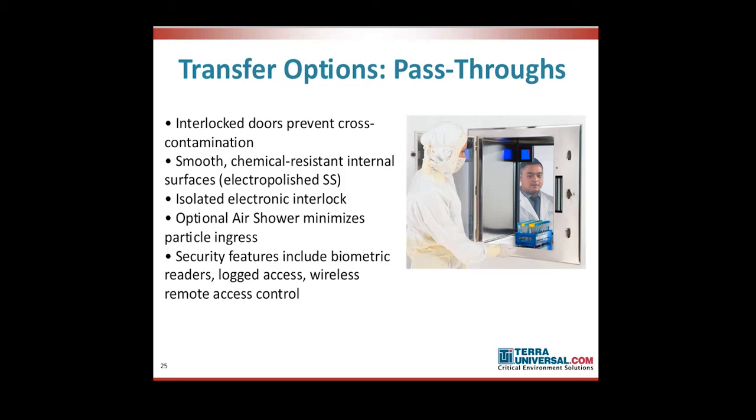So typically, when you're moving a cart into a buffer area, it should stay there for the duration of a compounding shift. So it's not a good way to move product in and out of the buffer area in a high workflow environment. That's partly because the cart would need to be decontaminated every time it moves in and out, and that's an involved process with many steps, and generally that would become cumbersome.